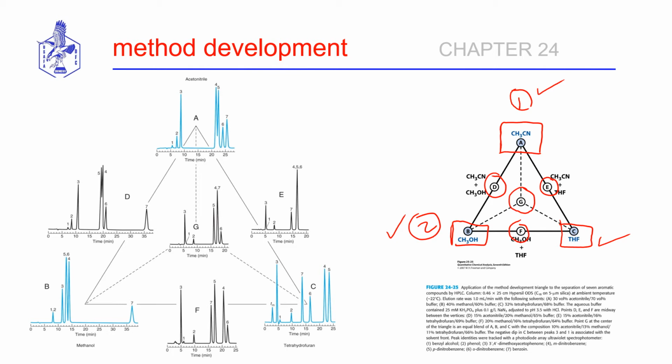If you get that data into a computer, there are programs that can be run which are going to help you identify your most ideal combination of those 3 solvents, solvent A, B, and C, to affect, once again, the complete resolution of all your components in the least amount of time.